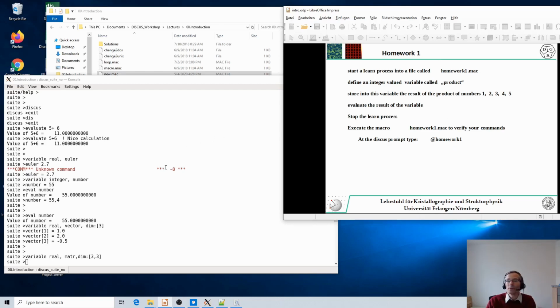So I give you a few minutes to run that by yourself. You might want to stop this macro, think about it. How do you build such a little macro? How do you store the variable? Go through the previous slides, rewind the clip a little bit and check that.